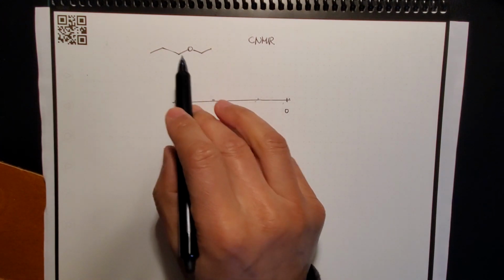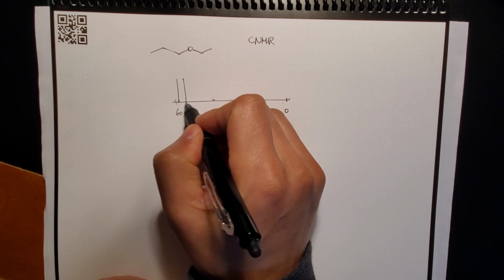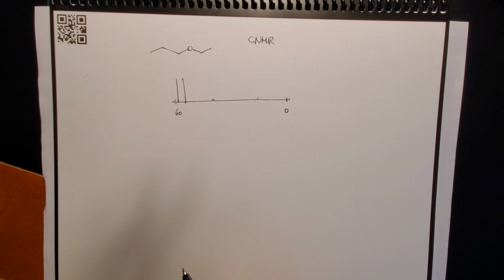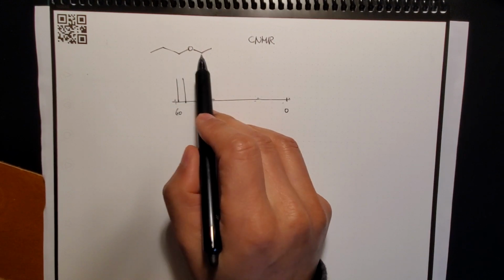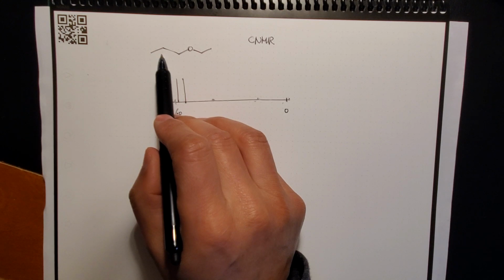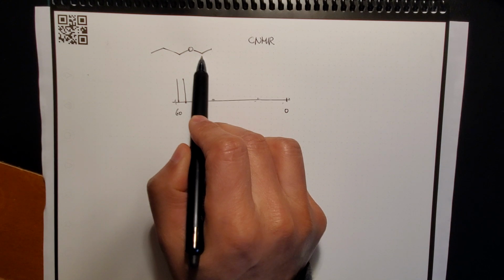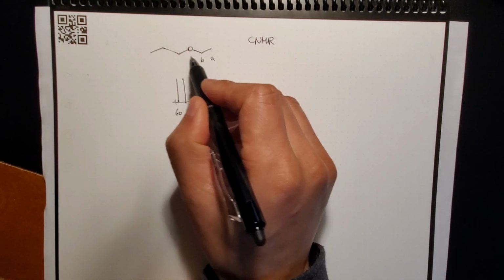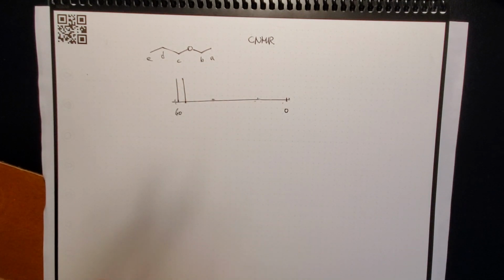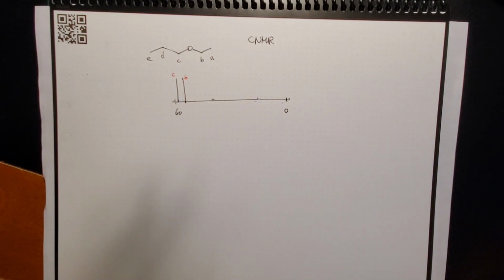So the carbons close to the oxygen, these two can show you a signal, one here, one there. And you can guess which one gives the higher frequency. Remember, these two are compared, and the neighbor has 3 hydrogens on this carbon, the neighbor has 2 hydrogens on this carbon. So this carbon is more shielded. Therefore, this should also be more shielded. So if I label A, B, C, D, and E, you'll see this signal is B, that signal is C, right? And then the following one.